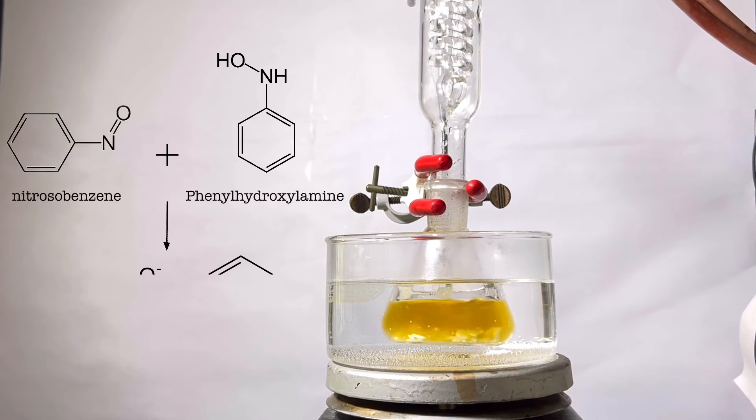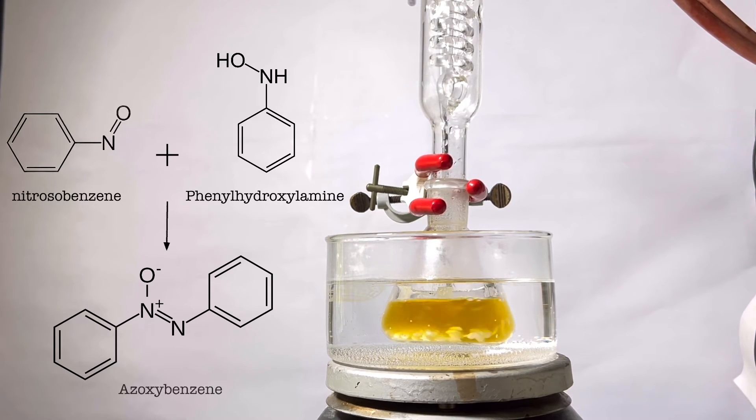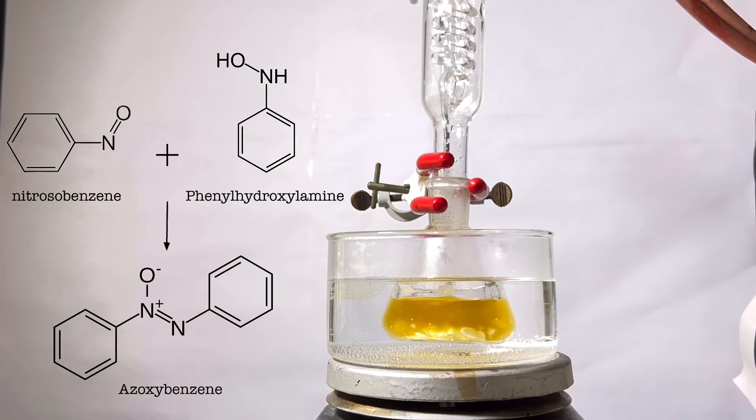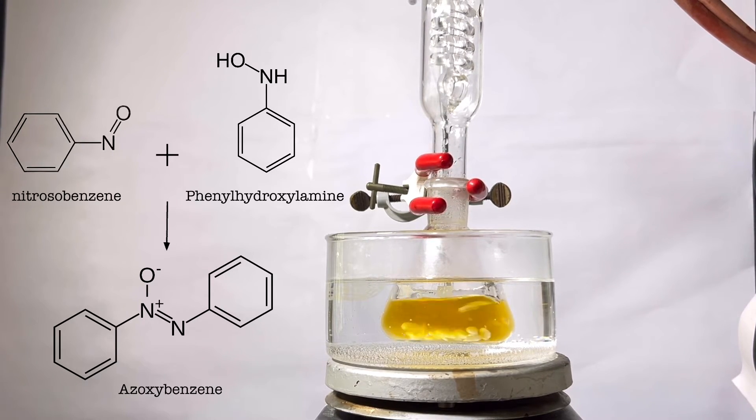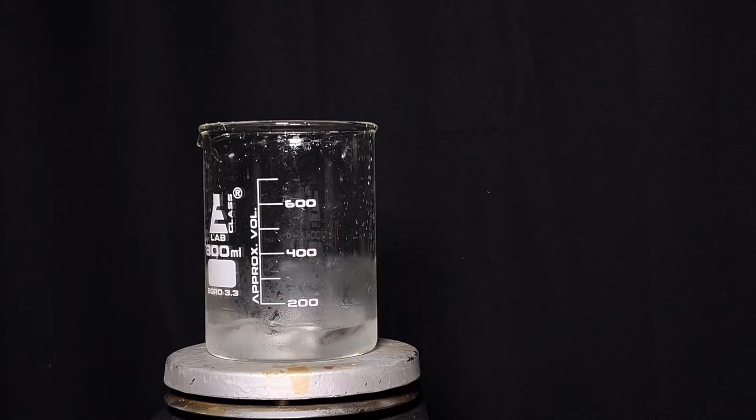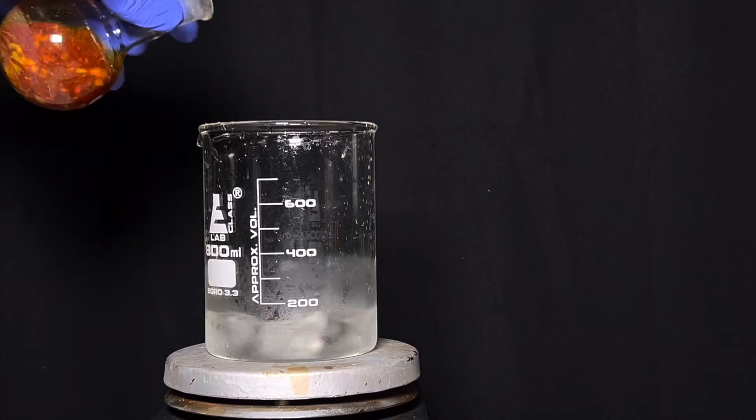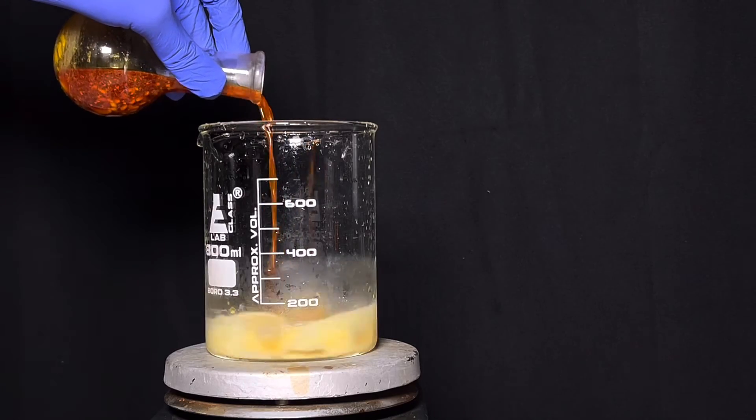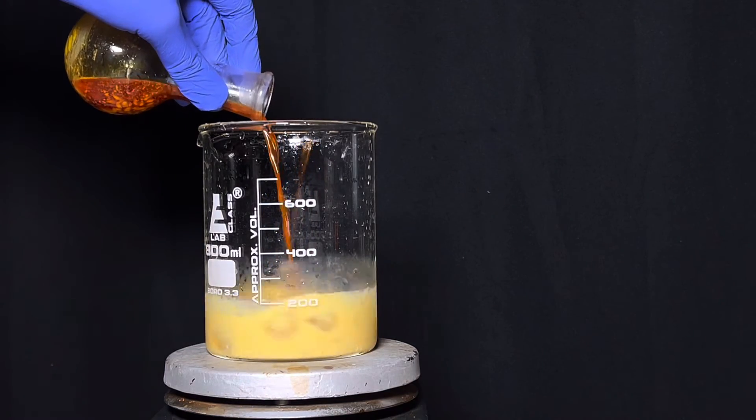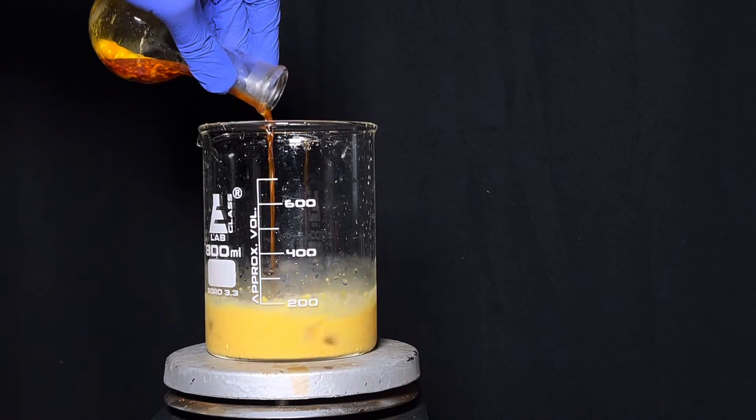After 1.5 hours of reflux, the flask was allowed to cool to room temperature and the contents of the flask were added to around 200 milliliters of ice water. Immediately, the crude product azoxybenzene precipitates out. All the chunks from the flask were added to the water.